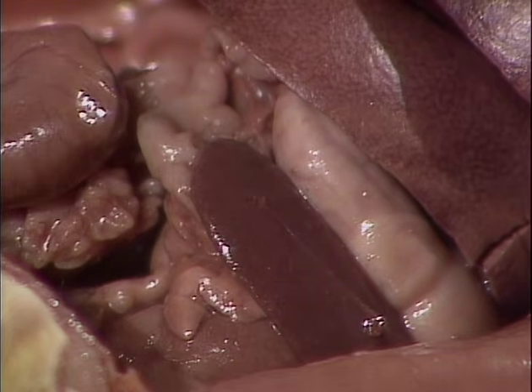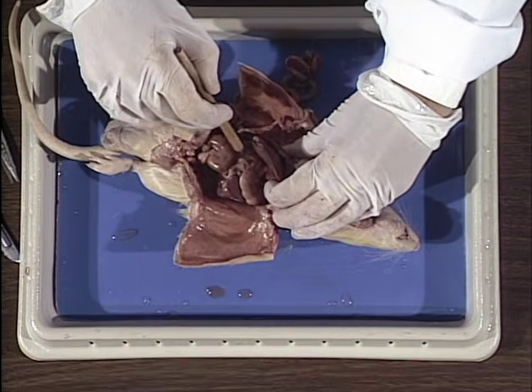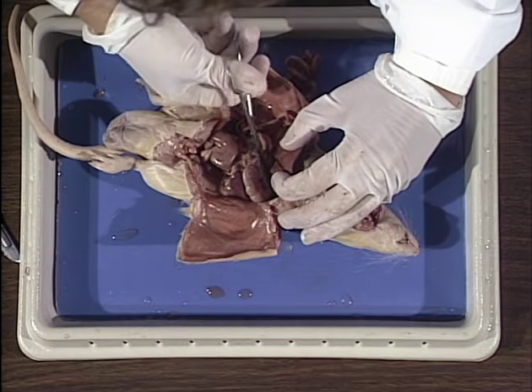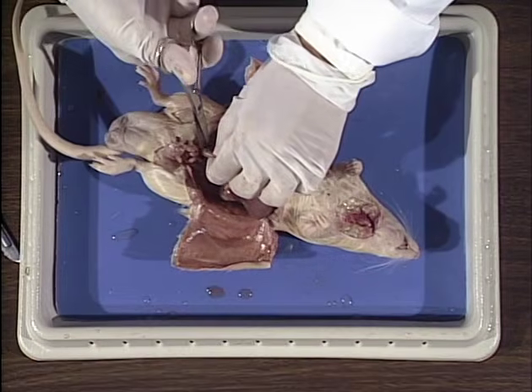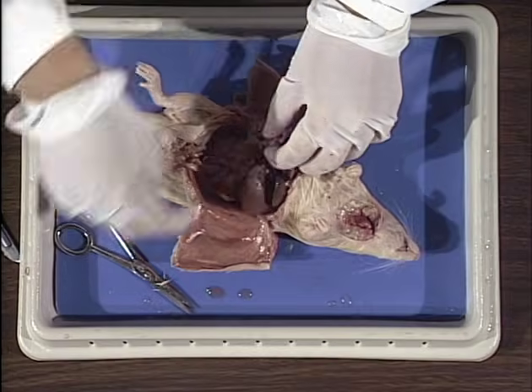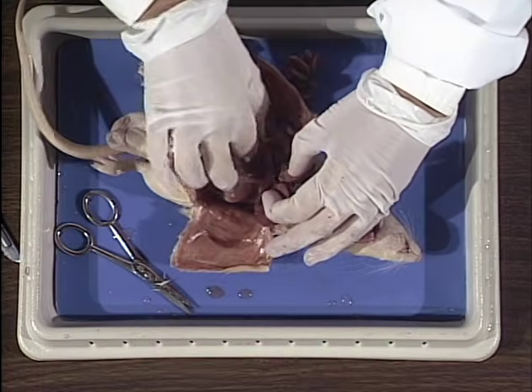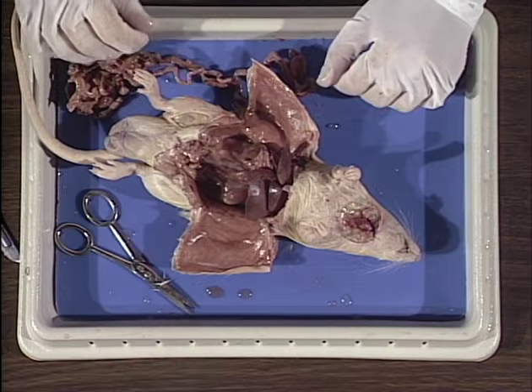We need to remove the entire digestive tract. We will remove it from the point where the esophagus enters the stomach down to the colon. Once we remove the digestive system, we will be able to study the reproductive and excretory structures. This ends the digestive system of the rat.